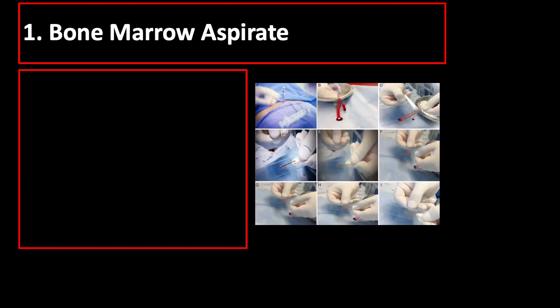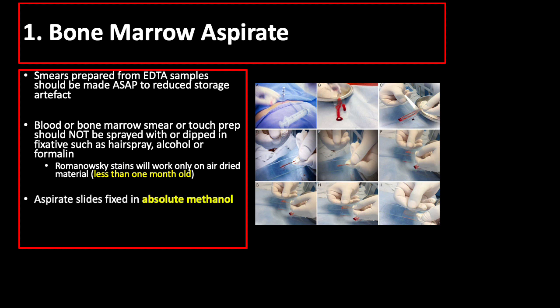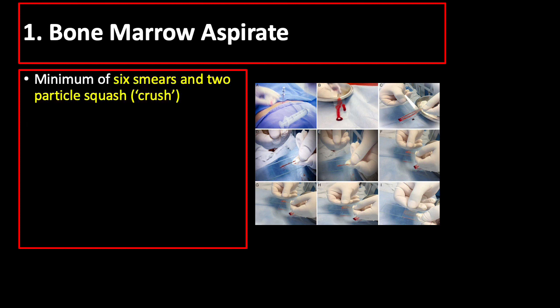Some essential things to remember: bone marrow smears should be prepared immediately following aspiration. Smears prepared from EDTA samples should be made as soon as possible to reduce storage artifact. Blood or bone marrow smear or touch prep should not be sprayed with or dipped in fixatives such as hairspray, alcohol, or formalin. Romanowski stains will only work on air-dried material that is relatively fresh and less than one month old. Unfixed and unstained aspirate smears stored at room temperature for long periods may give variable results on retrospective Giemsa staining. There should be a minimum of 6 smears and 2 particle squashed or crush slides made.